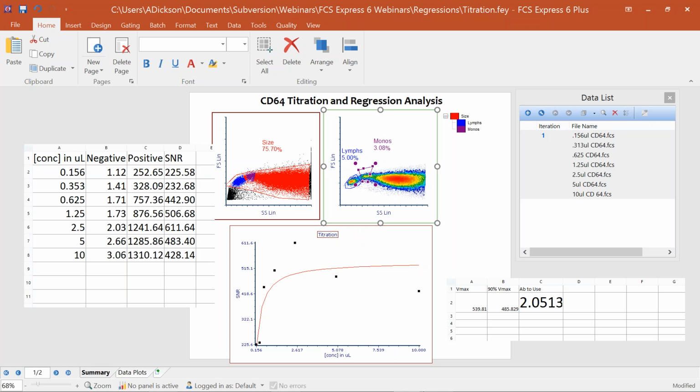Any questions at all about building out a regression with custom data in a spreadsheet or doing interpolations? If at any time you have a question, just feel free to write it in and we'll get to it. So this is kind of covering point 3. Now you can quickly and easily just load your data, do a titration, and calculate it out.